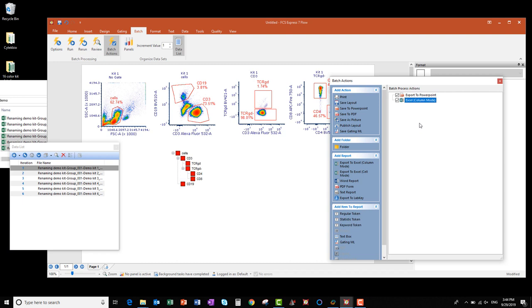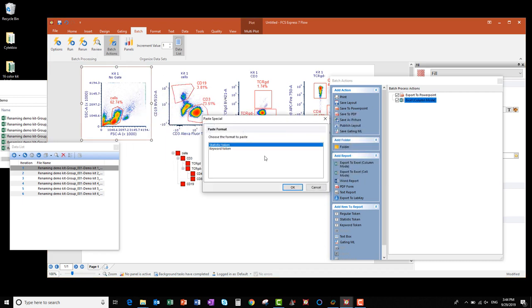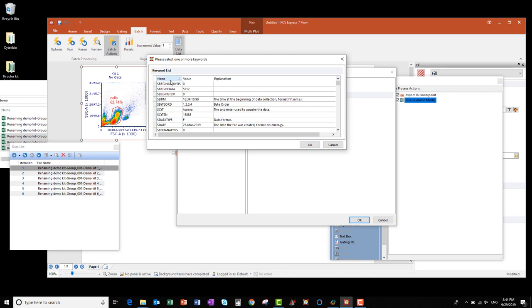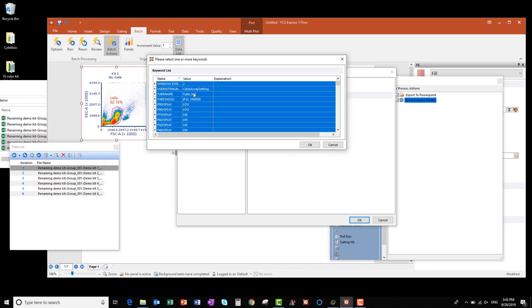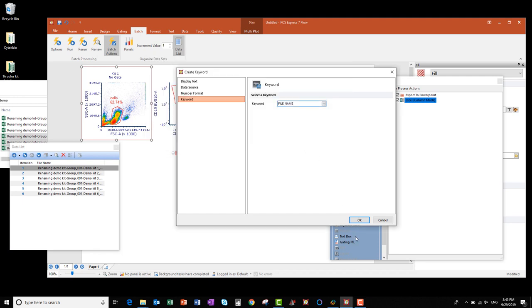Now I need to define the information I want in that Excel file output. To start, I'm going to click and drag my scatter plot to the Excel Column Mode Batch Action item. In the window that appears, I click Keyword Token, then OK. Then click the dot dot dot, click the Name column to sort the keywords by name, and scroll down to find the file name keyword — which for this first file is going to be Kitch1. Once I've located it, select it, click OK, and click OK again.